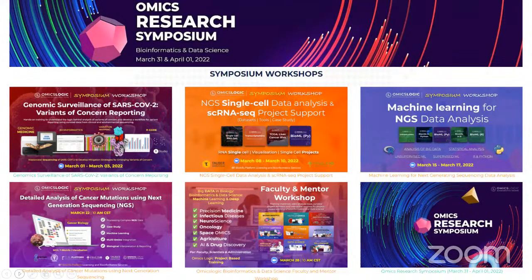So in today's workshop, we will learn about an overview of the current scRNA-seq technologies, a basic overview of pipelines for processing raw reads into expression values, quality control of single-cell RNA-seq data, dimensionality reduction, and clustering techniques. We'll have practical sessions that use a case study approach with curated project datasets to learn about generating a table of expression from raw FASTQ files and performing subsequent analysis of this table of gene and isoform expression.